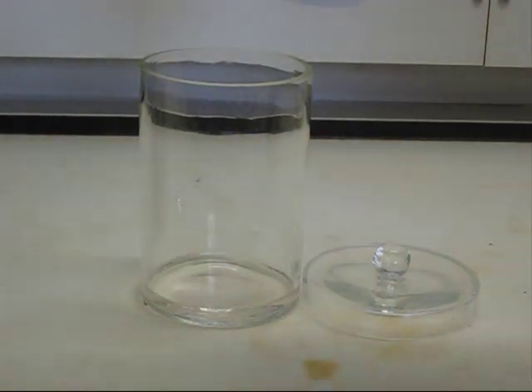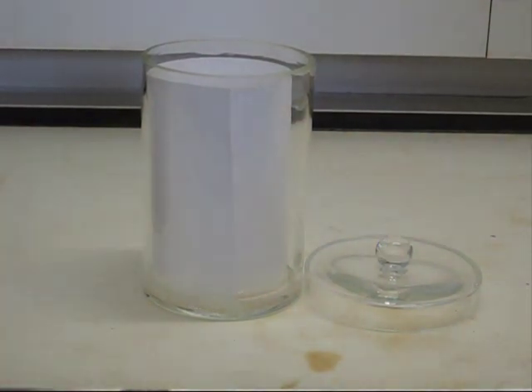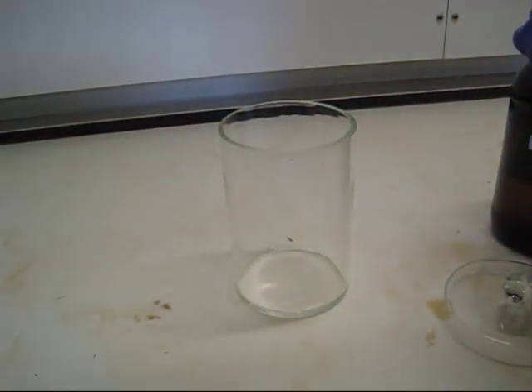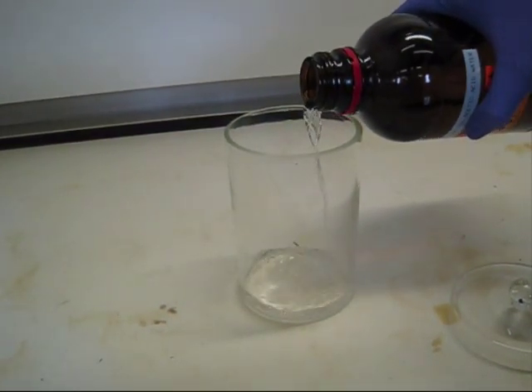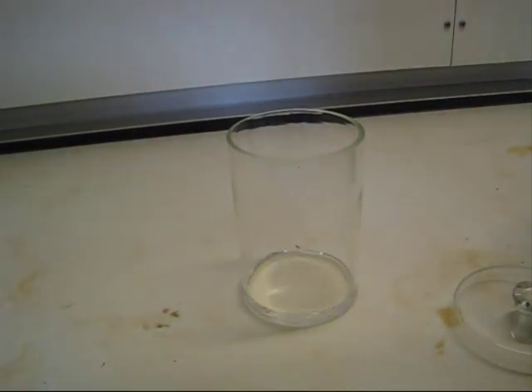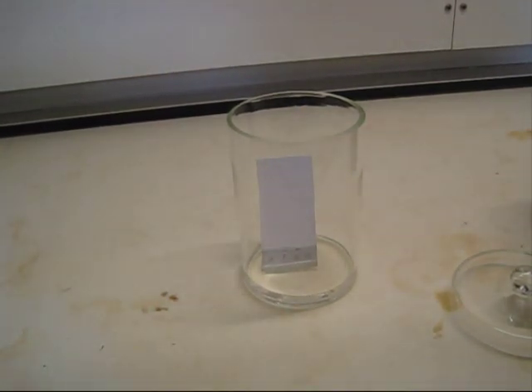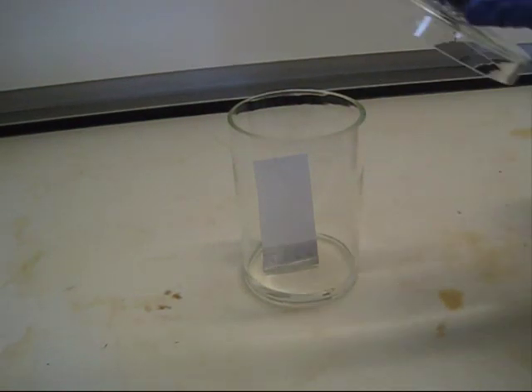Normally when performing a TLC you will need to put a filter paper inside the TLC tank to create a saturated environment. However, for this demonstration we won't be using it. To run the TLC, ensure that there is a mobile phase in the bottom of the TLC tank. Place your spotted TLC plate in the tank and wait for the solvent front to reach roughly 1 cm from the top of the TLC plate, remembering to replace the lid of the TLC tank.